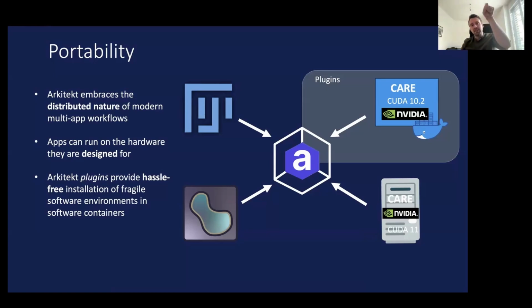They have all of the dependencies inside, and they can be installed through a simple install from the App Store. So there's an Arkitekt app store where these plugins are. And what happens when you start them, they download onto the server, or an engine that can run it, and then run the plugin there. And so Napari, in the workflow, so to say, would call this plugin and get the result back.